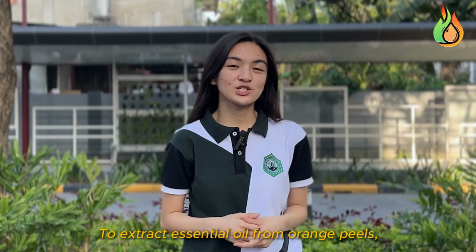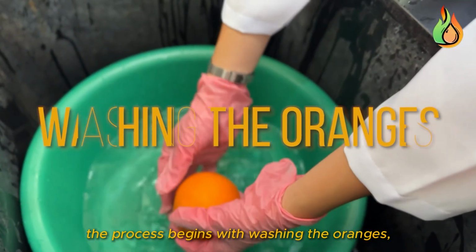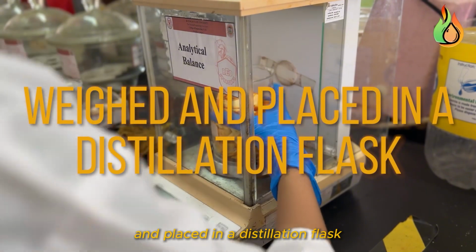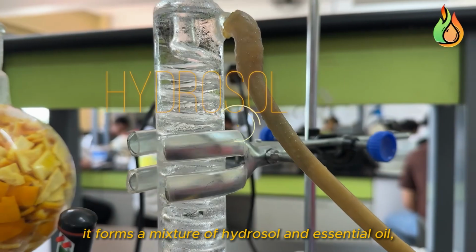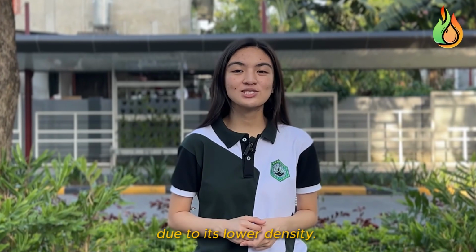To extract essential oil from orange peels, the process begins with washing the oranges, followed by peeling and cutting the peels into small pieces. The peels are then weighed and placed in a distillation flask filled with distilled water. As the steam cools and condenses, it forms a mixture of hydrosol and essential oil, with the oil naturally separating due to its lower density.